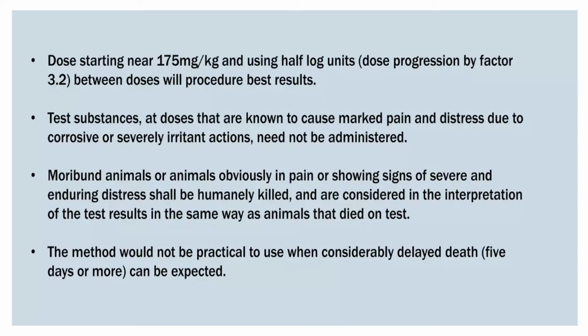We have to kill the animals in the presence of a veterinarian, or ask them what is happening with these animals, and only then can we kill. We have to sacrifice, collect their organs, and send them for histopathological evaluation.